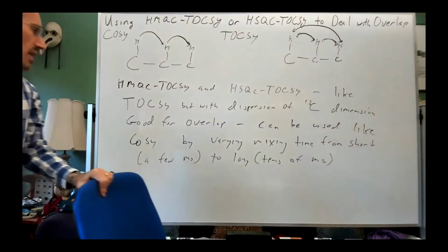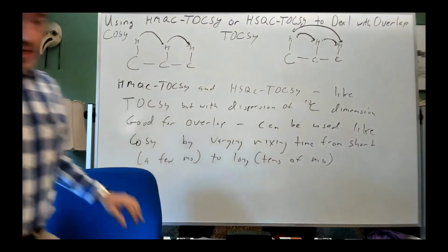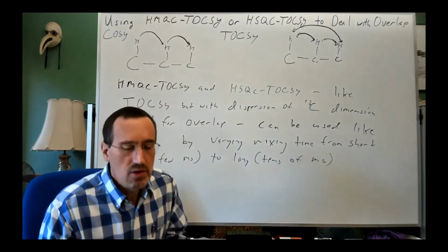So it can be used like COSY by varying the mixing time from short to long.